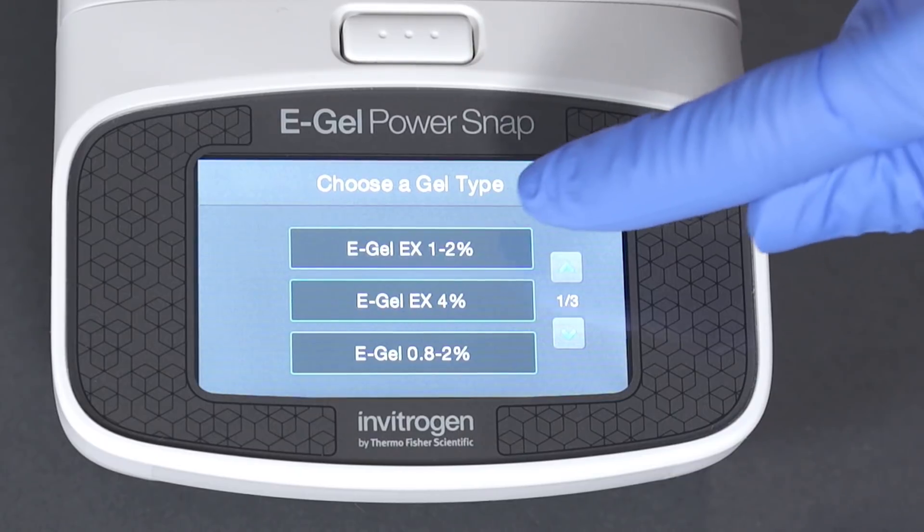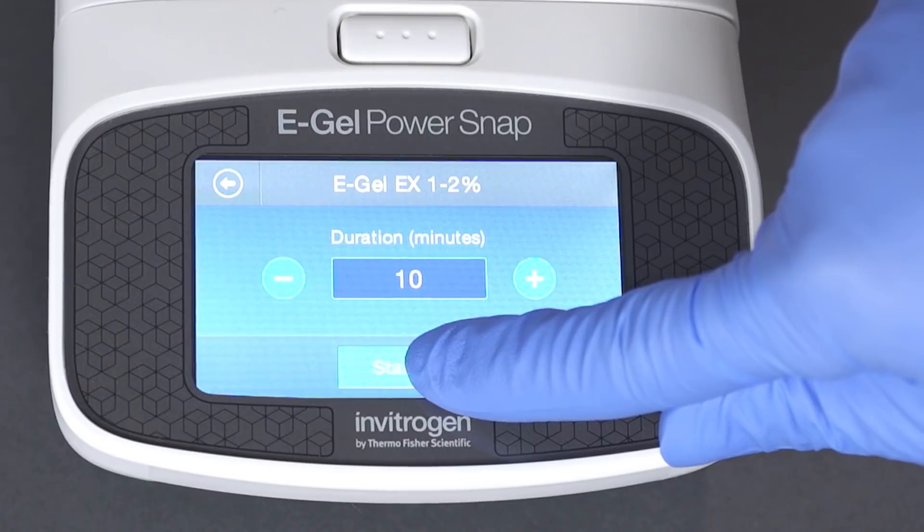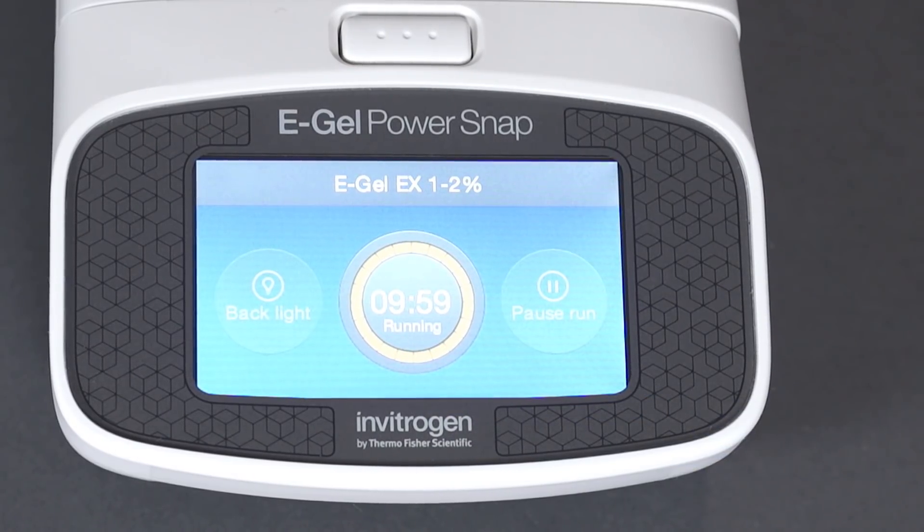To start your run, select the program and time for your gel and press start run. You may use preset parameters or adjust the run time to your needs.